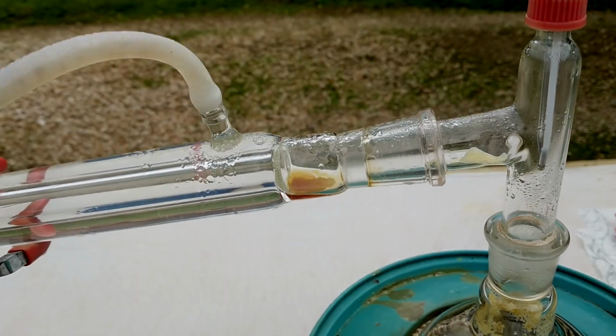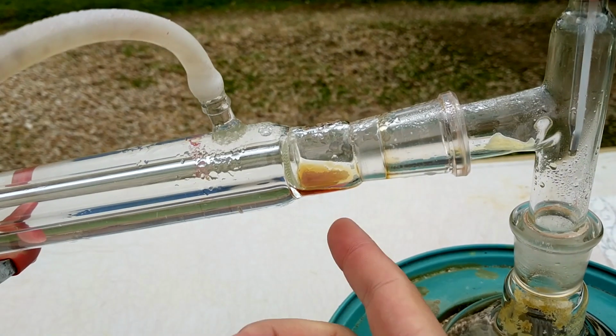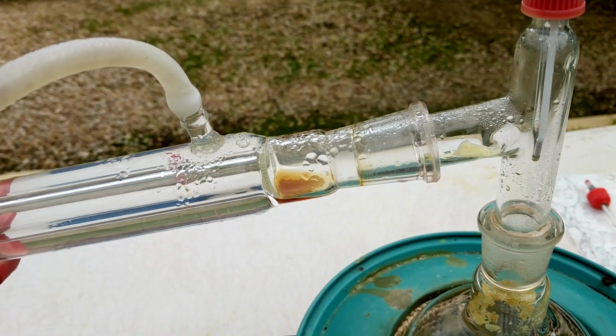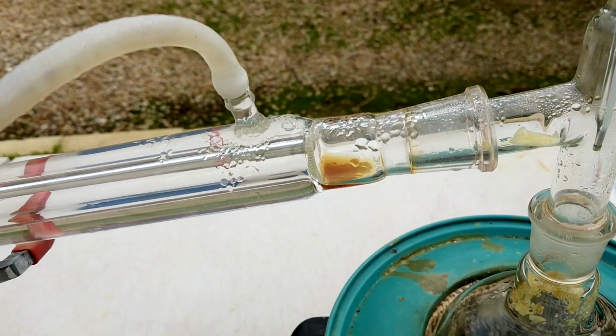Now we're back in some daylight, we can see that there's quite a bit of niacin that came over. Now everything's cool, the niacin kind of precipitates out. I think I did just get a little bit too excited with the heating, especially with the blowtorch around the side, that kind of drove over quite a bit of niacin.